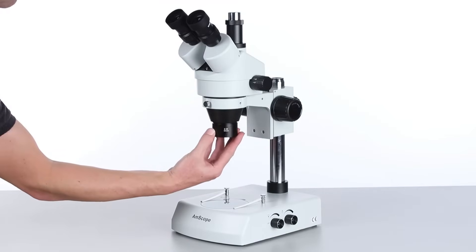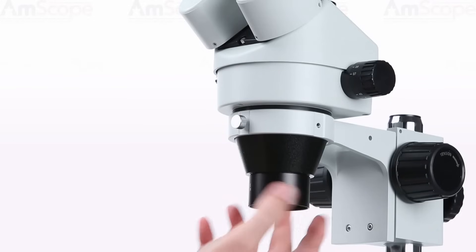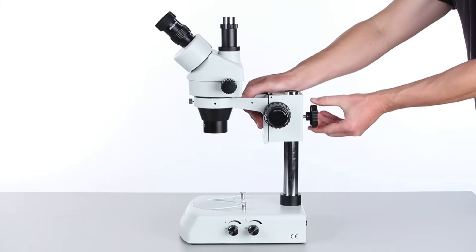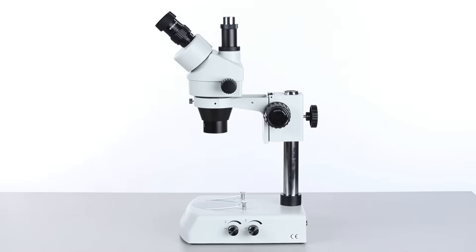The 0.5 Barlow lens will decrease the magnification by one half. The decreased magnification will require a larger working distance, so the focusing rack must be raised.